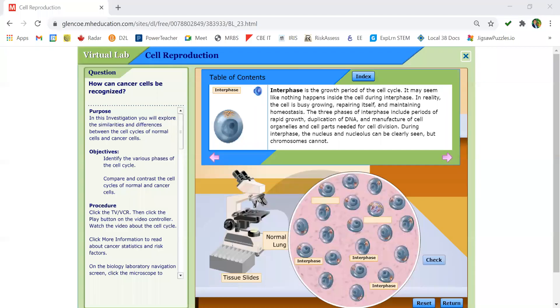This video is a recording of a virtual cell cycle lab. We will look at different human tissues and identify the stage of the cell cycle a cell is in. We will also count the number of cells in interphase and the four phases of mitosis to determine the mitotic index of the tissue.